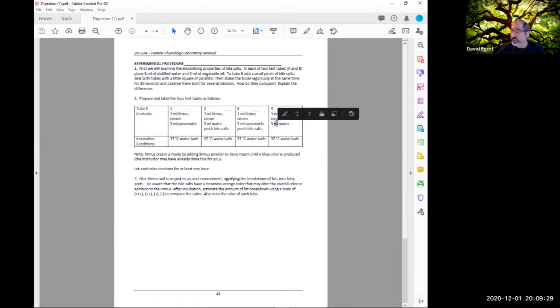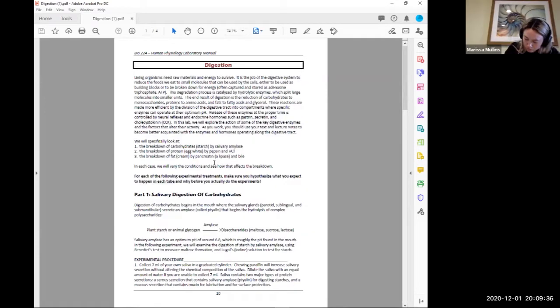What about cream just sitting with water? Would we expect that to break down much? Not really. All right. So experimental procedure.